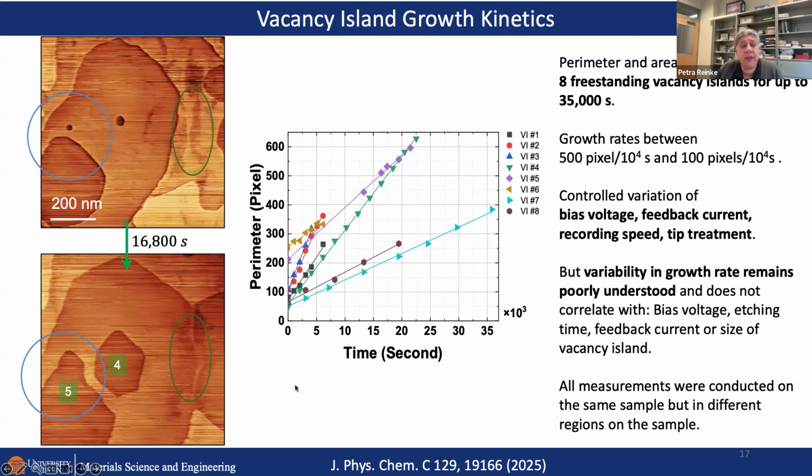In order to look at the kinetics, we used only islands which did not undergo coalescence, and we stopped recording the information for this graph the moment they coalesced. At some point this small island coalesced with the big one, and at that point we stopped recording it, or we only started to record the larger island here. Island 4 is wonderful because it's particularly well behaved. It's the green one you can see here, and we can follow that one over a really long time.